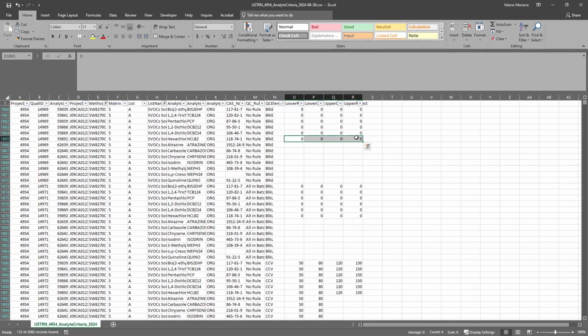We can see which values are typically used for an element and copy them down to any blank rows. For example, we can see the BLKE element is filled with zeros for the original analytes. We can click and drag to select the last populated row for BLKE along with the blank rows.